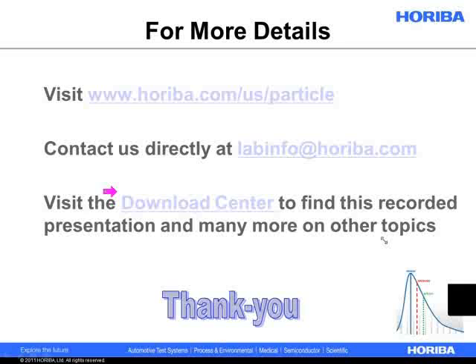Manish is asking, if you don't know the refractive index of the particular sample, what refractive index should we use? Very good question, very common question. Refractive index is probably one of the areas that most laser diffraction users feel most uncomfortable about, because a lot of times your company or your research group or university are manufacturing novel particles where you can't just turn to the CRC handbook or the manufacturer of the particle for information about what the refractive index is. And we run into it an awful lot in our applications lab here.